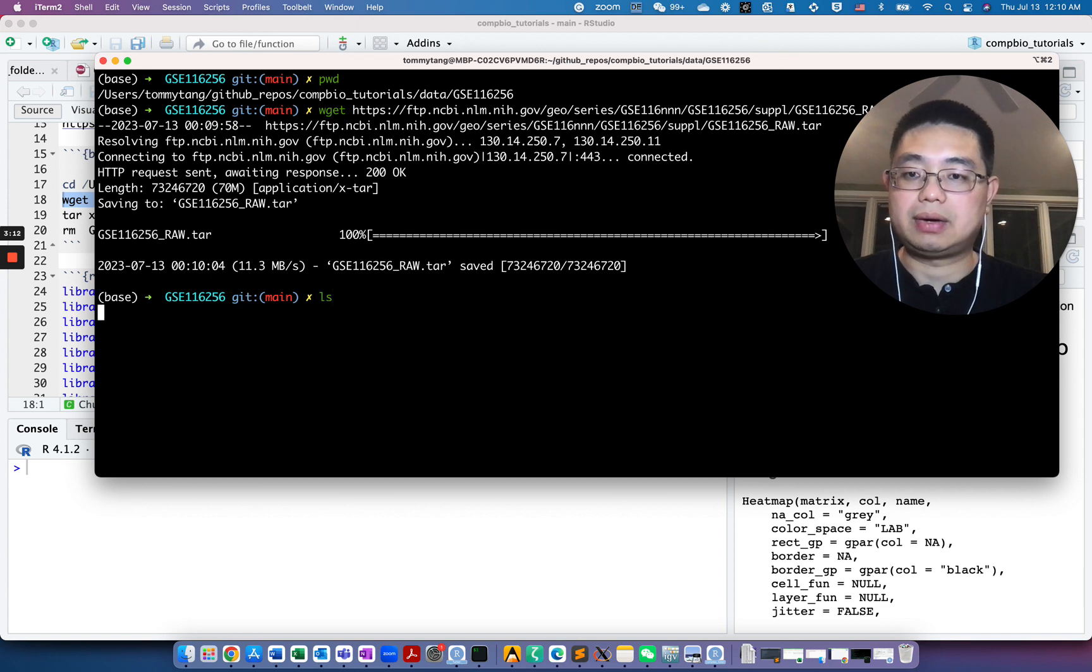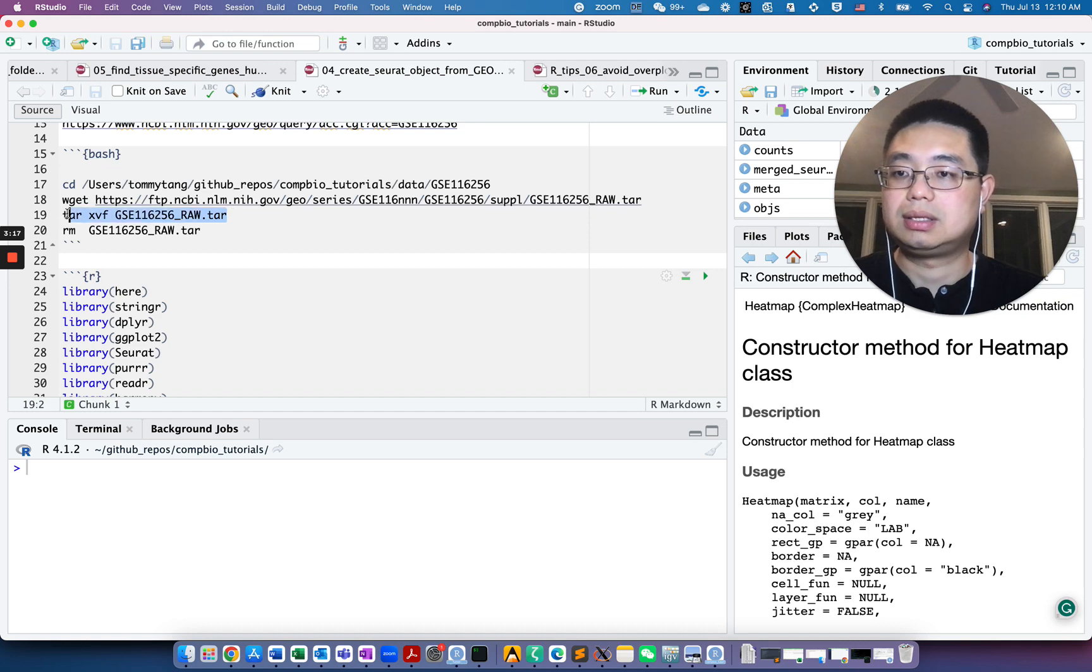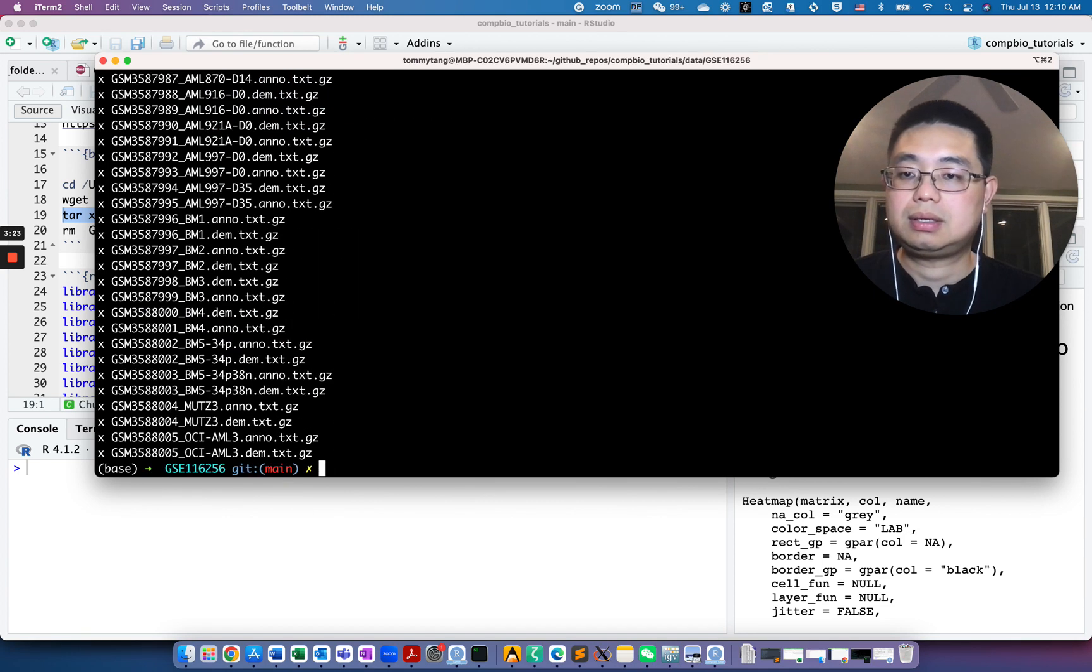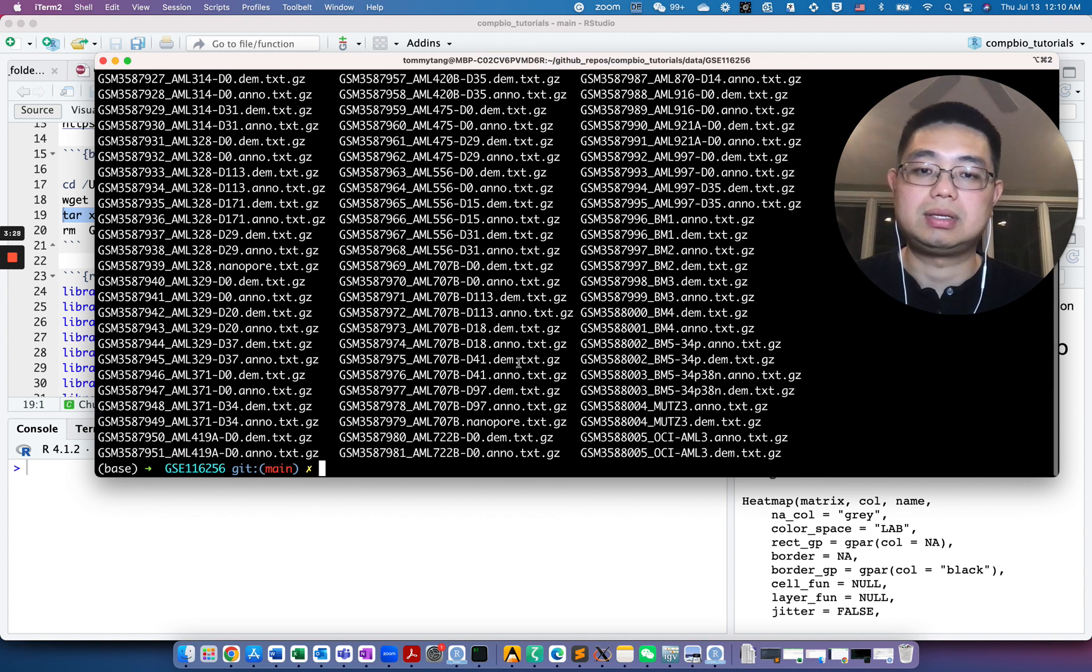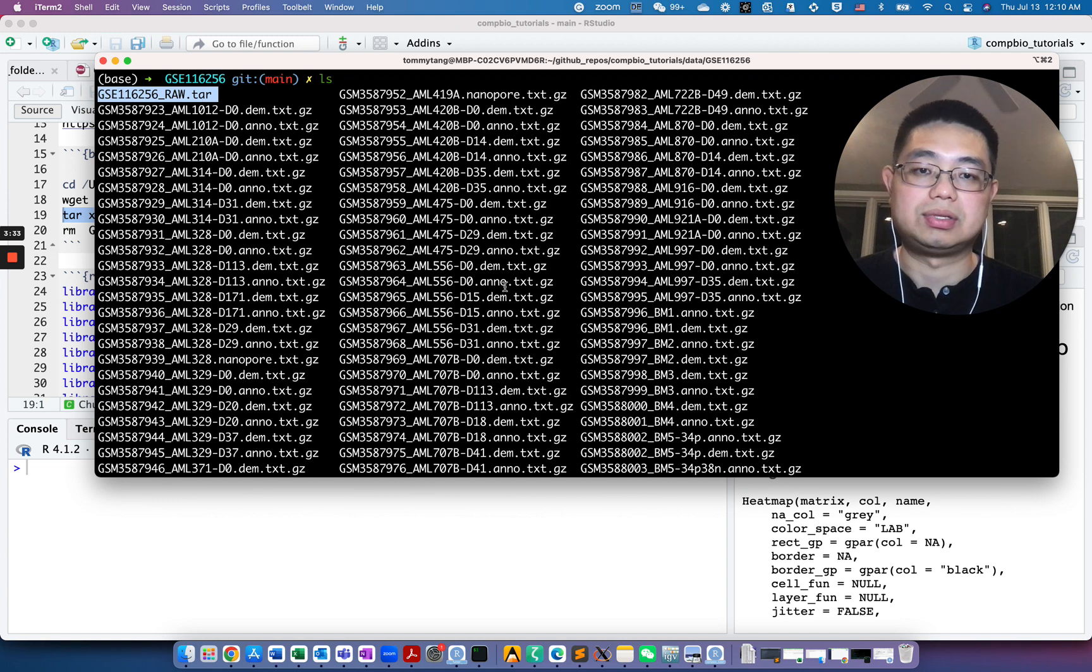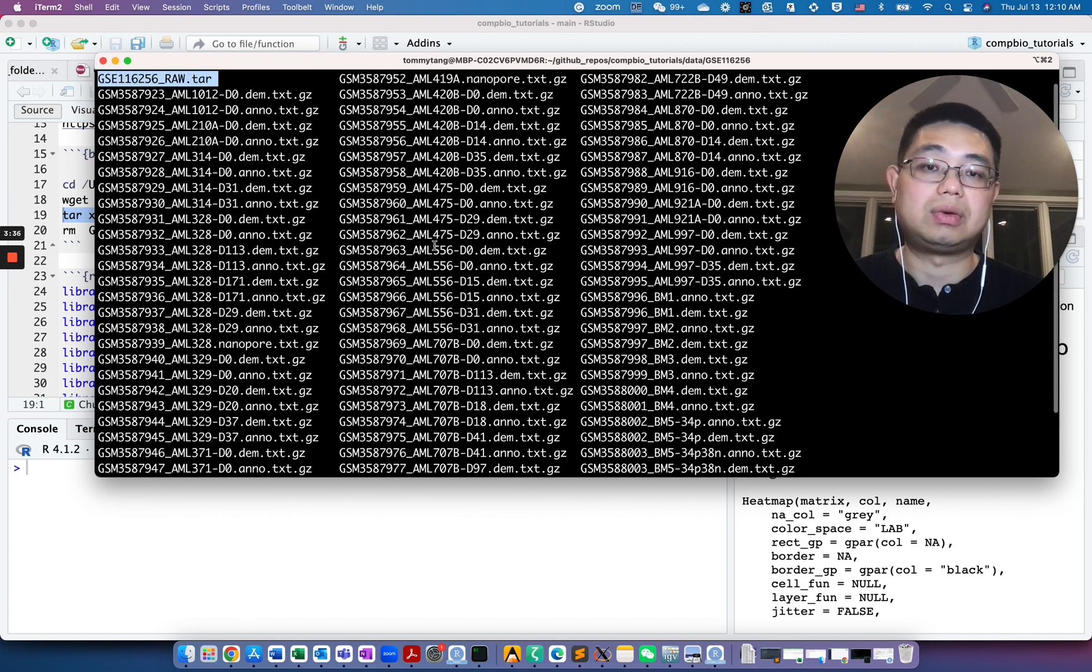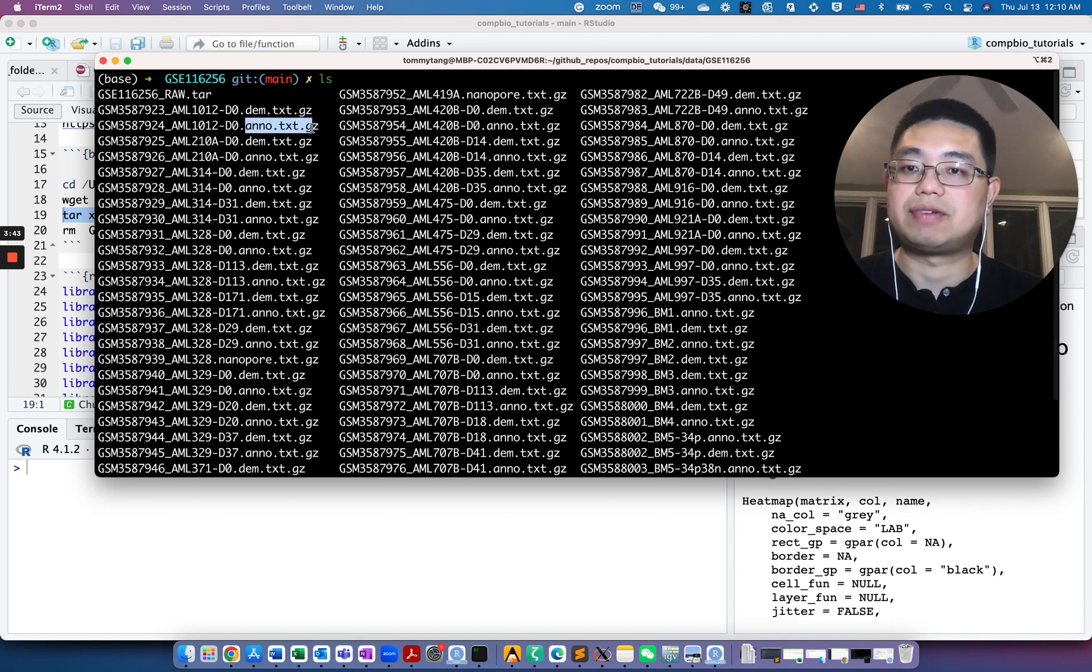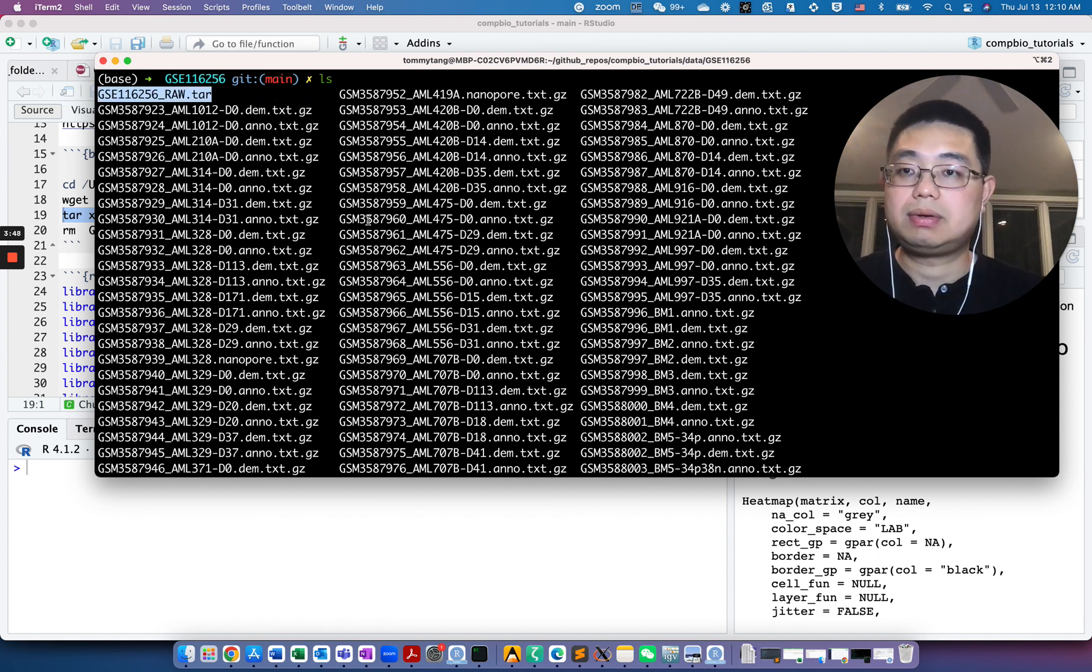If you use ls, it's a zip file. So next let's unzip it using the tar xvf command. Let's look at it again. Now you see this is the original file and those are the unzipped files. You see there are actually 43 samples and together they also have the annotation file. This is the data count matrix. Let's first remove this file.